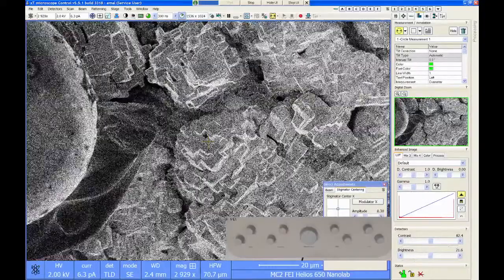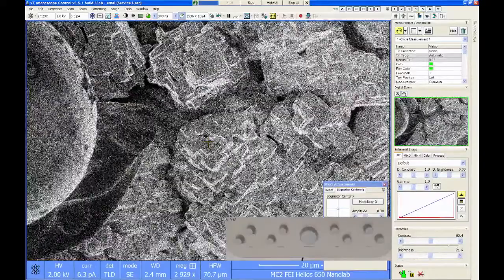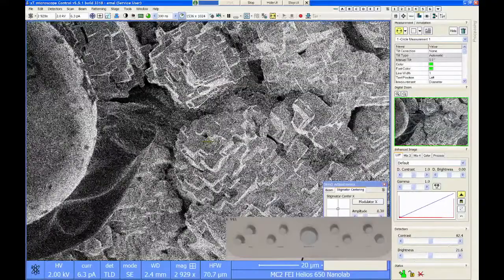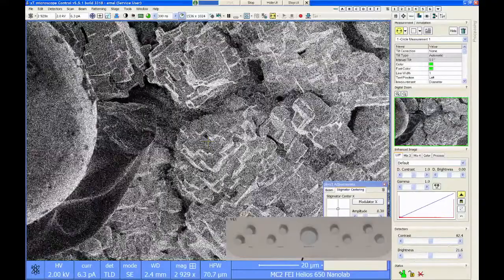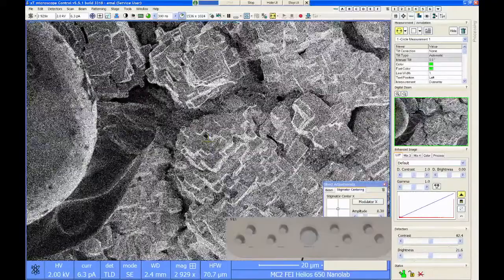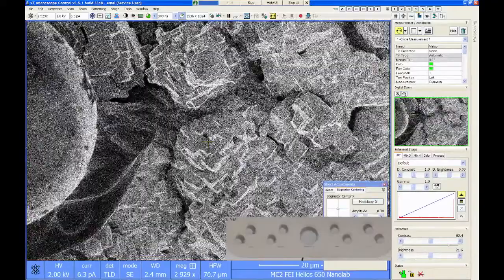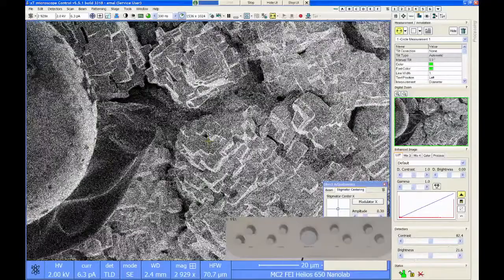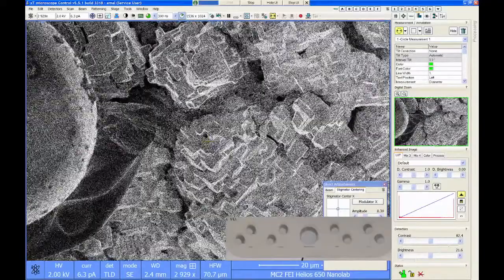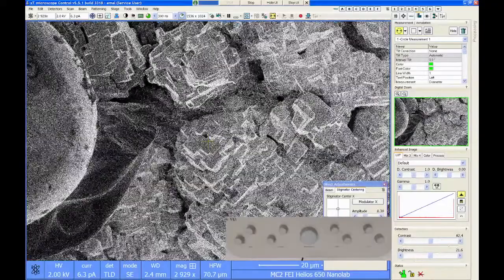I would say try it with the Helios or another SEM. And if you're happy with the resolution, great. If the nanoparticles are like 50 nanometers in diameter, the Helios will do fine. You'll be able to see them, you'll measure them, it'll be very precise, you'll be very happy with it. But if you've got 2 or 3 nanometer particles in your size distribution, I think even the Helios is probably going to let you down.